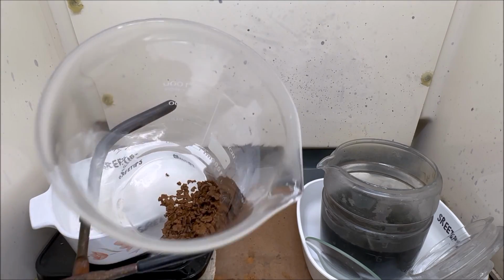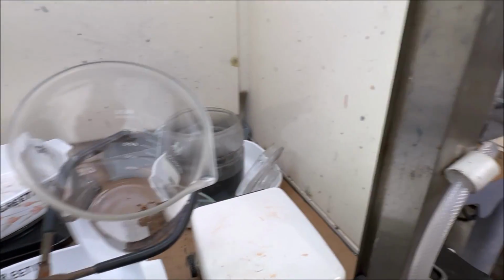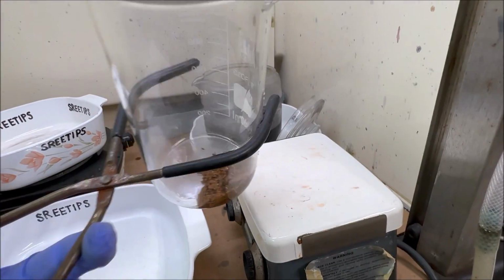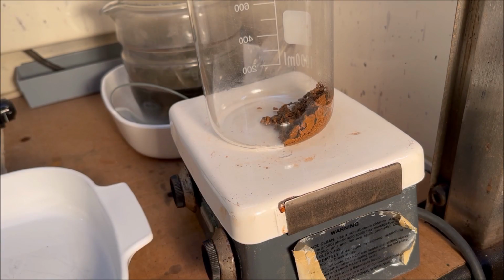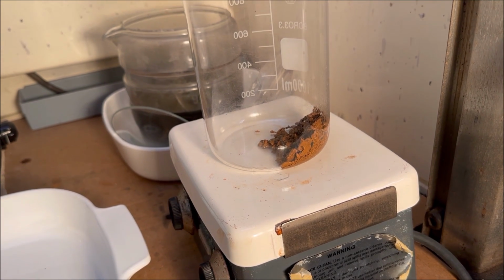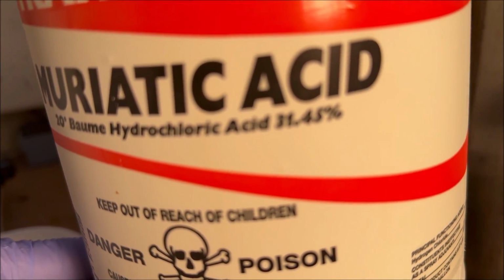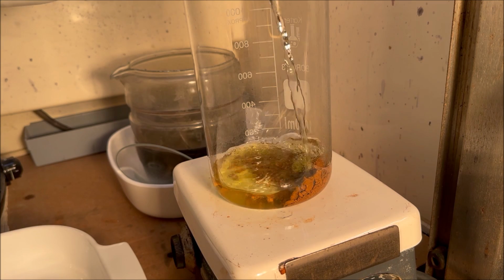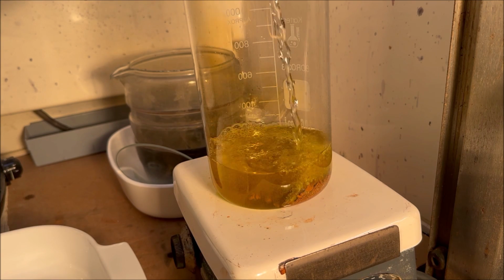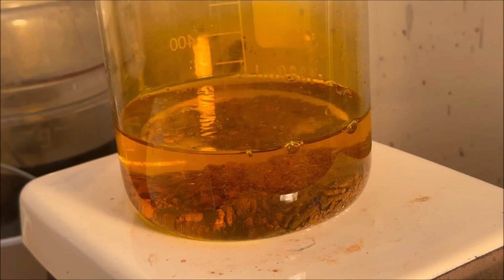All right, here's our gold. I think what we're going to do is set this gold up on our hot plate here. There's about 40 grams of gold in here. And what we're going to do now is add some hydrochloric acid. Well, let's see, about 250 milliliters, I guess, of hydrochloric acid. The gold has already started to dissolve.